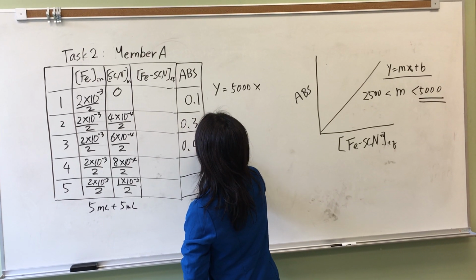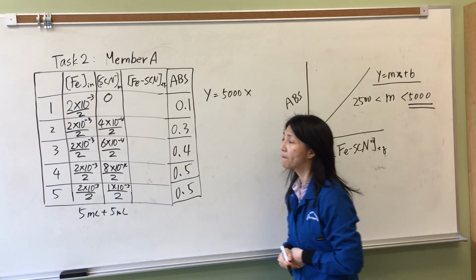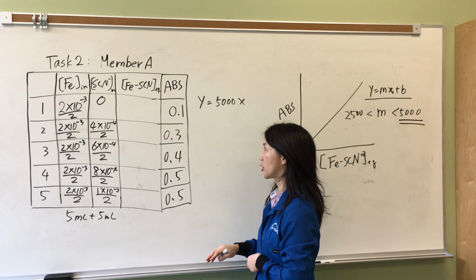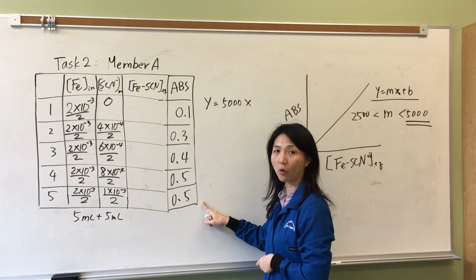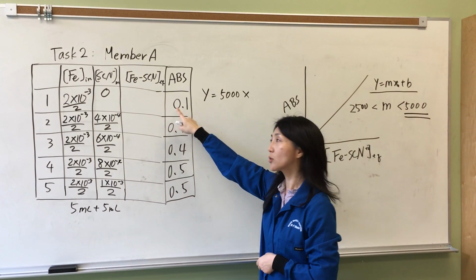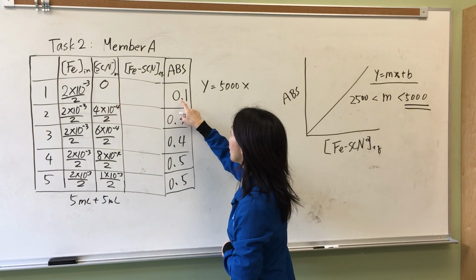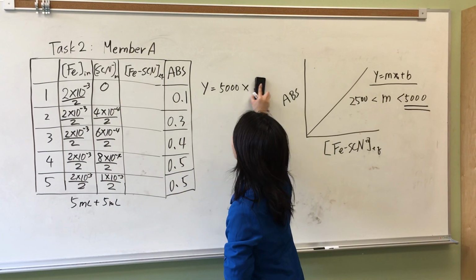Since we measured the absorbance at room temperature, those concentrations from standard 2 to 5 should be close. The standard 1 is a blank because we didn't put any thiocyanate in it. So we use this absorbance to correct your absorbance.